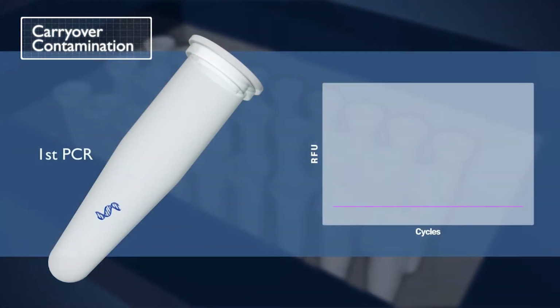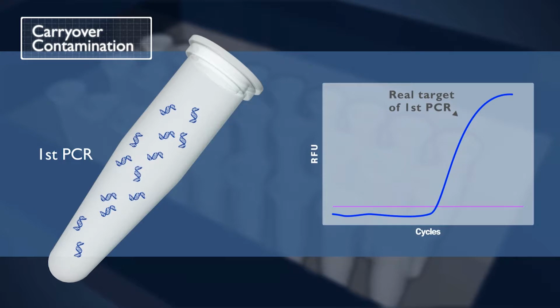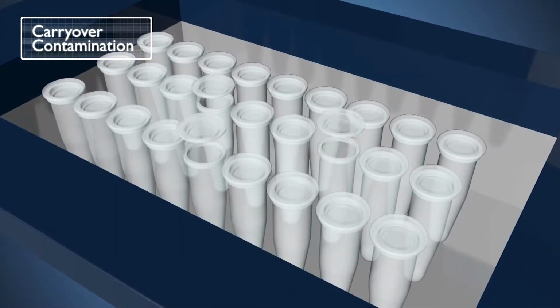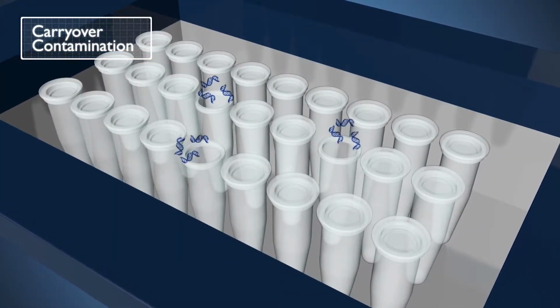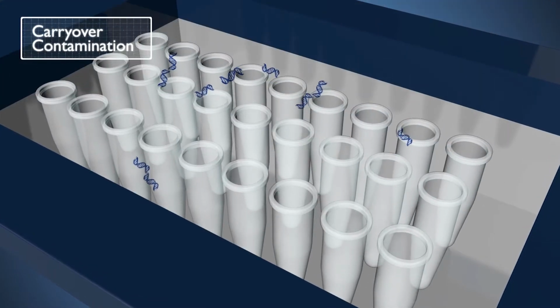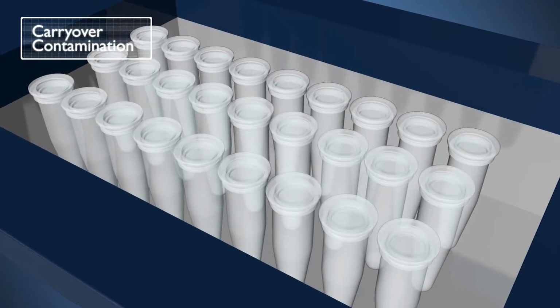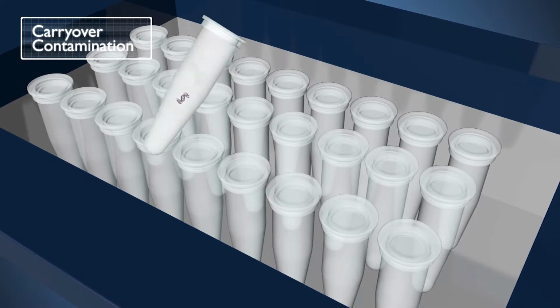PCR has continuously evolved from endpoint PCR to qPCR. However, PCR is still not entirely free from false positive results caused by carryover contamination. Via various routes including air, the next PCR mixture can be contaminated by previous PCR product.